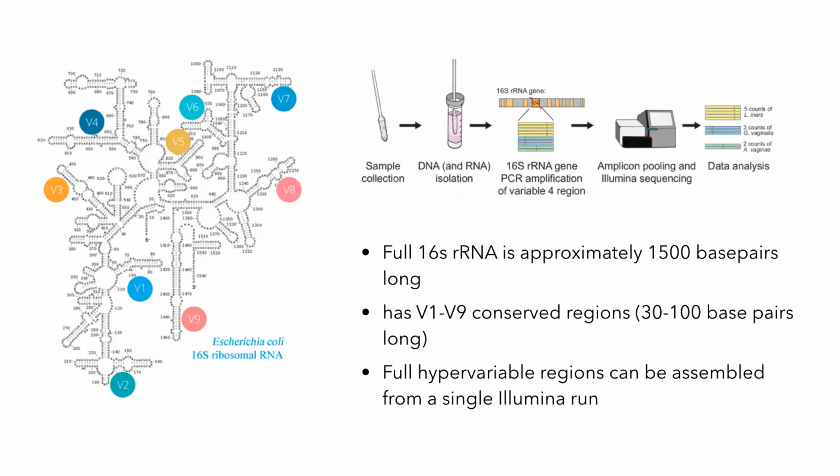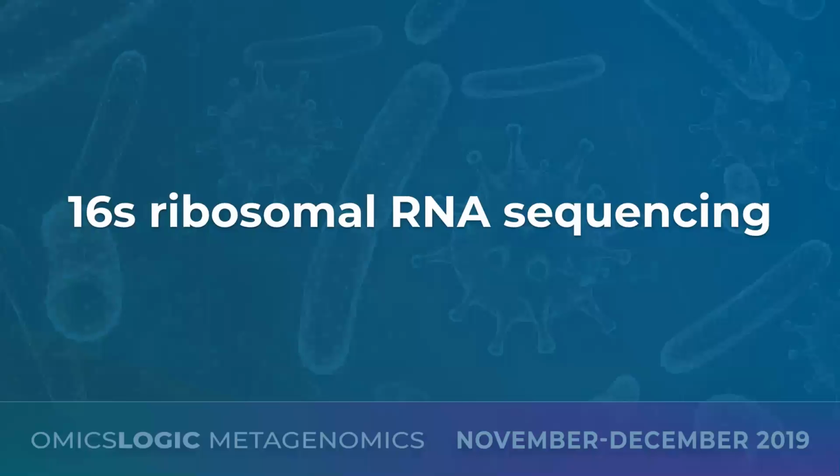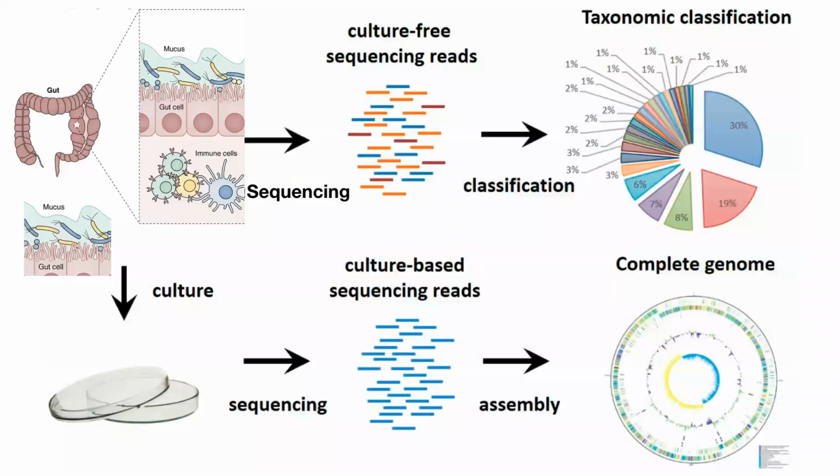If we go back to the slide right here, when we have a swab, we're really talking about taking the mucus, and then we have a limited amount of that material to extract what we're looking for.